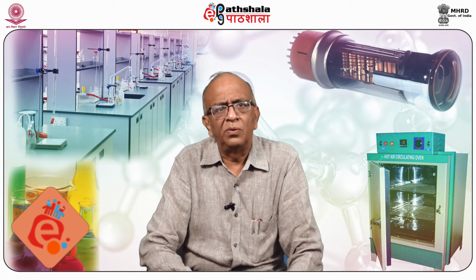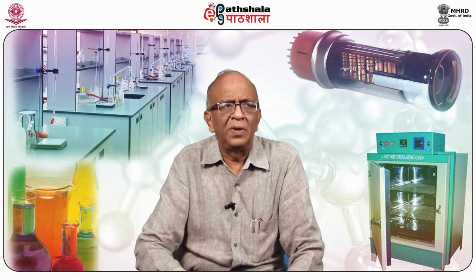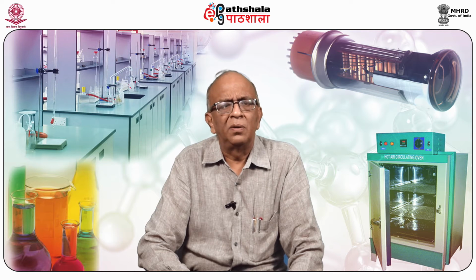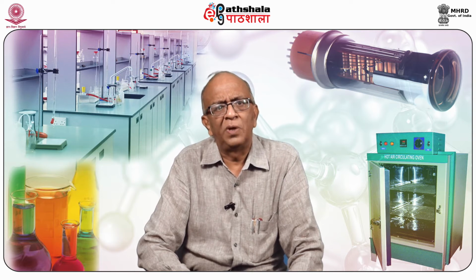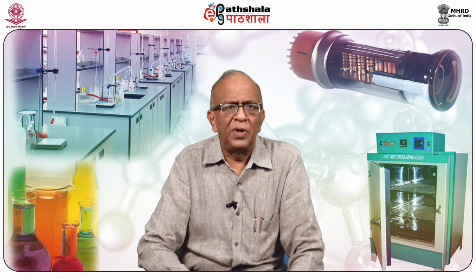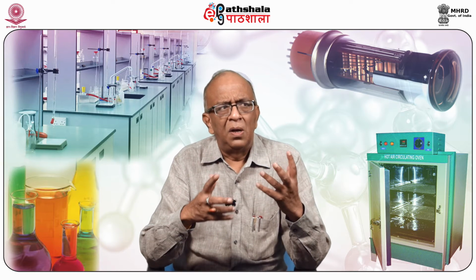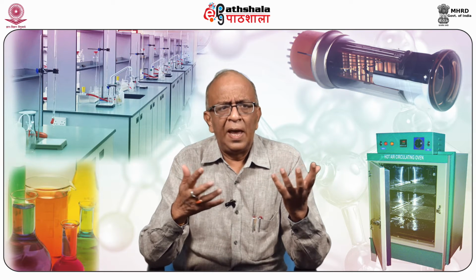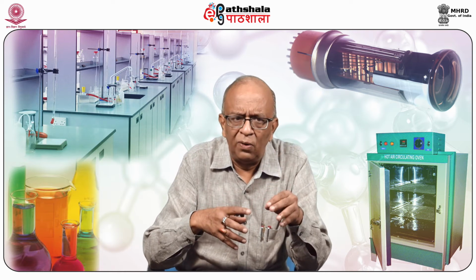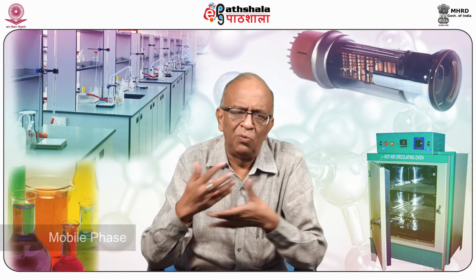Today we are going to discuss some fundamentals involving gas and high performance liquid chromatography in chromatography part 2 under the paper Fundamentals of Analytical Chemistry. Learning objectives of today's lecture is that, as you know, there are two phases in chromatography. One is the stationary phase and another is the mobile phase.